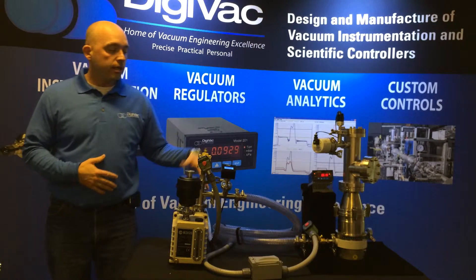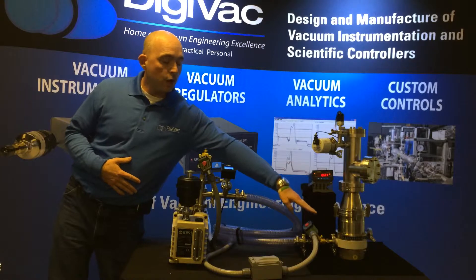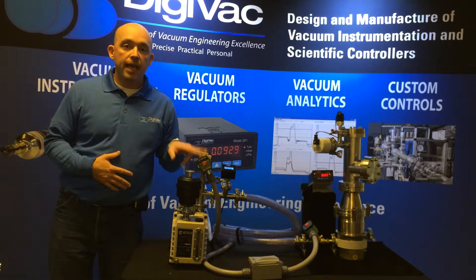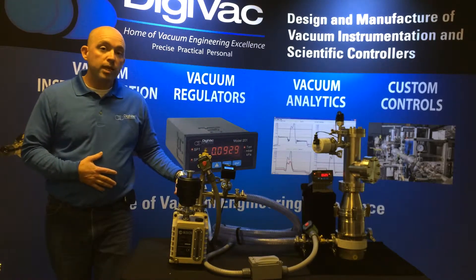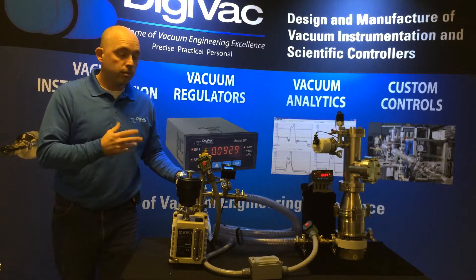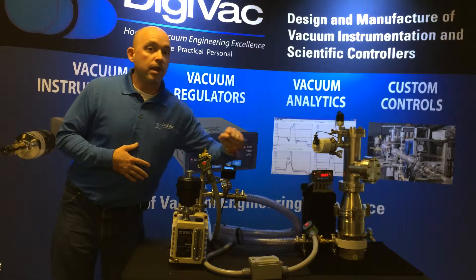What it's composed of is a foreline measuring gauge — this is our Model 22W. We've got an isolation valve, we've got a vacuum brake valve, we've got all the associated wiring wired back into the pump power, so the valves turn on when the pump turns on and the valves turn off when the pump turns off, and also a switch to allow manual activation of the isolation valve.